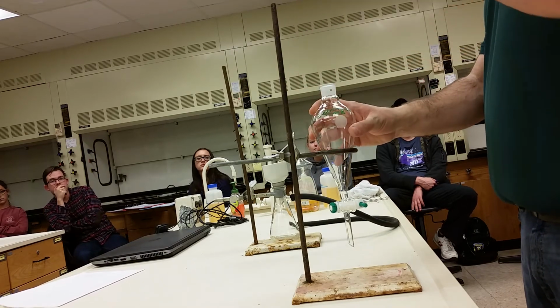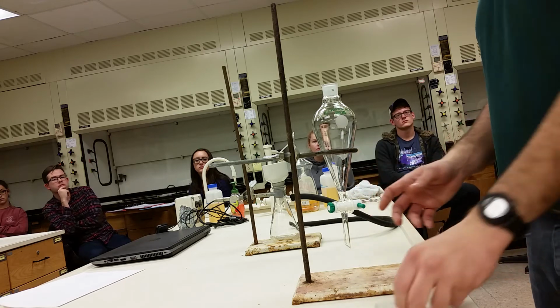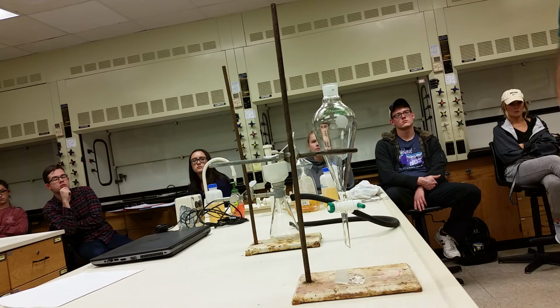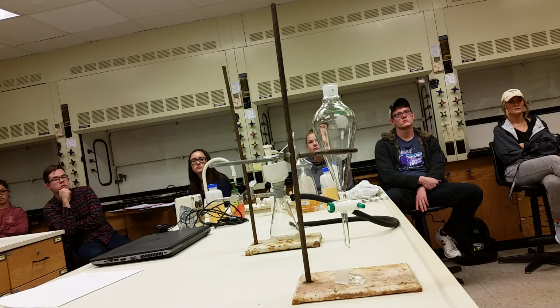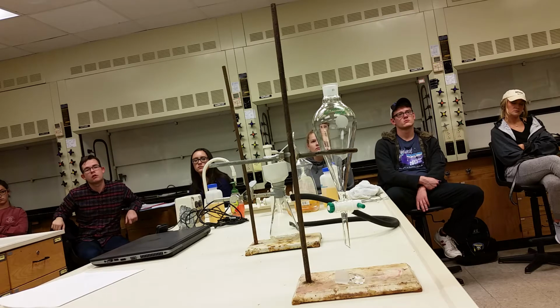You take the lid off, the stopper, and you let the two layers separate. If you do not remove the stopper, pressure will build up in the separatory flask and it will force the stopper out of the flask into your hood and it will make a mess. It will break and there will be glassware inside the hood that you'll have to clean up.